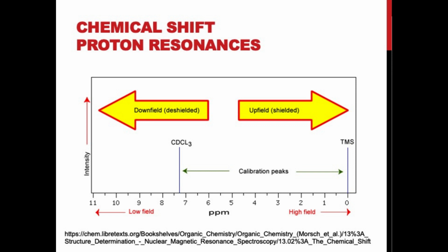What happens is we will use the little bit of regular undeuterated chloroform, CHCl3, as an internal standard to calibrate our spectra to what it should be. So you could say, I ran my NMR, I got this value, and this chemical shift is relative to my residual chloroform signal being set to a given value.